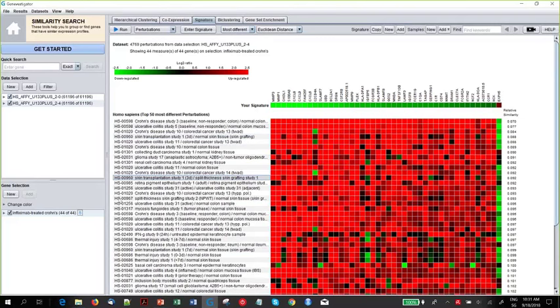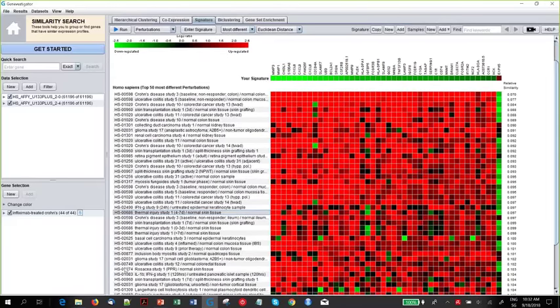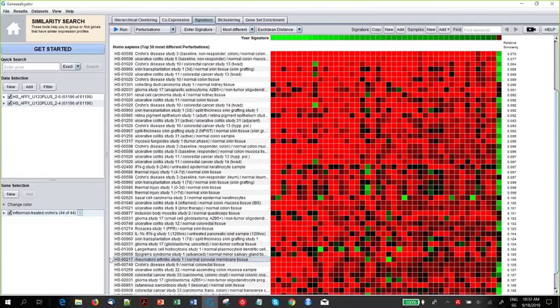We find comparisons on split thickness skin grafting, mycosis fungoides, a thermal injury of skin, etc. We also find further down rosacea studies on autoimmune disease of skin as well. And so, as you might remember from the introduction, infliximab is also used as a therapy in several dermatological conditions, mainly autoimmune ones, and also against rheumatoid arthritis, which we also find here in the list.